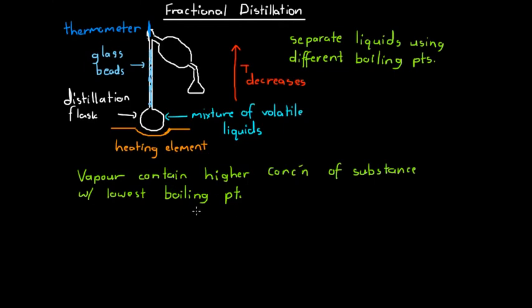And so what we do is that once stuff gets to the top, obviously the longer we run this process for, the hotter the whole column gets.